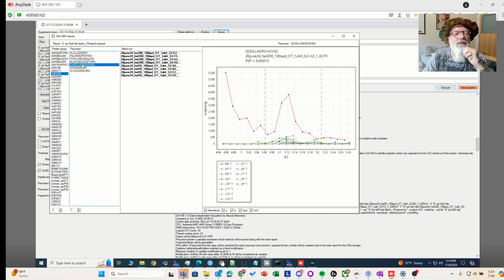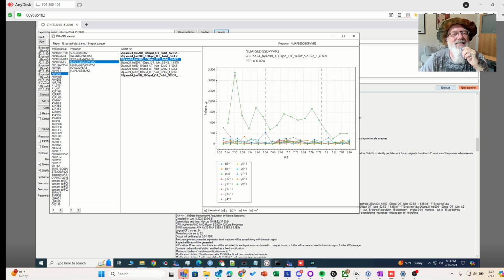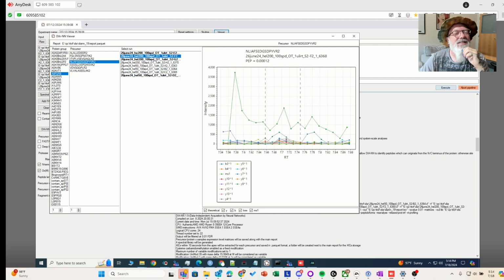Okay, and you could see with this one, this was identified here. Oh, that looks crazy bad. This one, and then it's not even identified in these. You can see this is really sketchy. And it's probably because of this right here. See all these fragments collide?